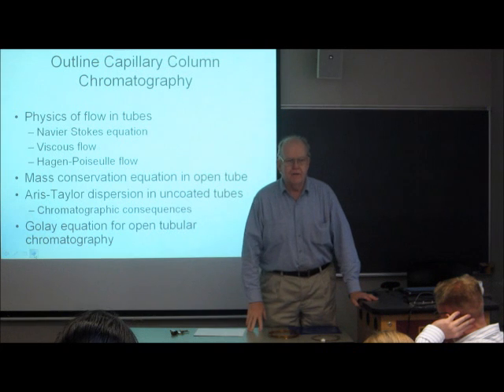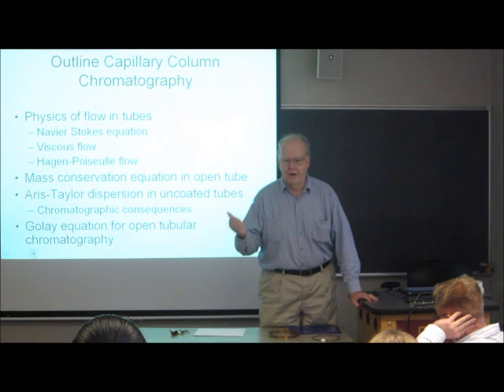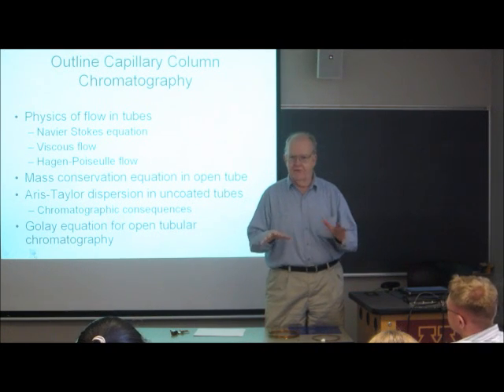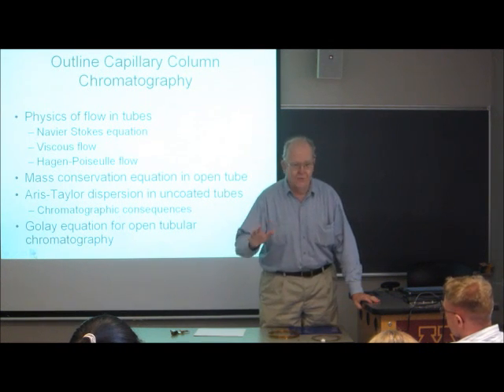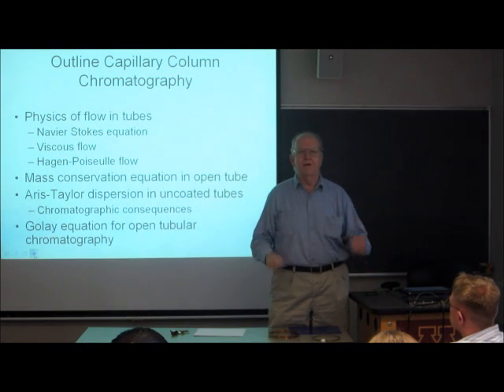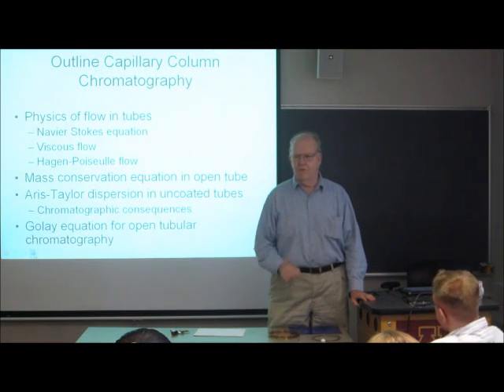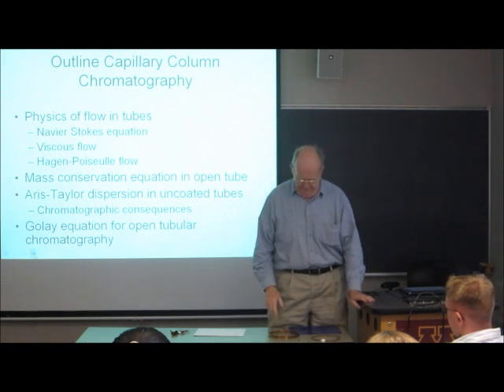And stainless steel is chemically sound, inert, but it is not really inert. When it's heated up to, say, 300 degrees centigrade, and you're injecting nice fragile organic compounds, if they get to the surface of the stainless steel, they're toast, literally. You don't want that to happen. So the next stage of development was they went from stainless steel to glass capillaries. Now glass is much more inert than stainless steel. It's lighter than stainless steel, but if you touch it wrong, it's a broken capillary, and you're out a lot of work and a lot of money.